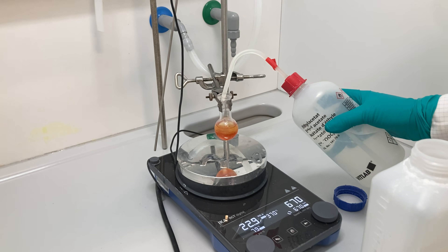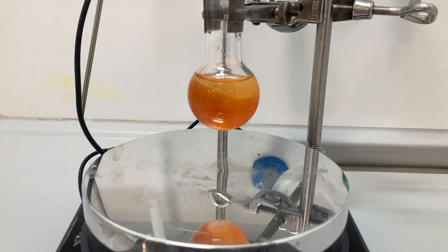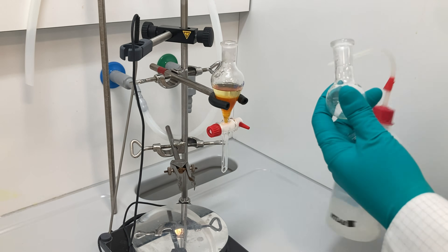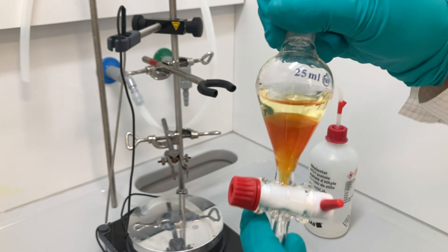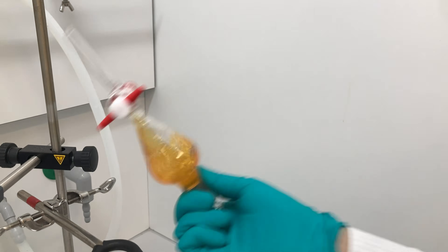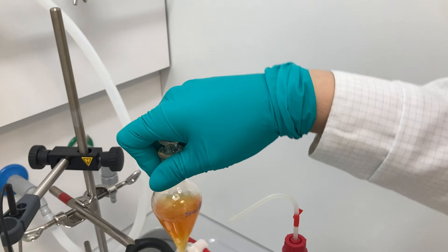I diluted the mixture with ethyl acetate and allowed the biphasic mixture to stir for a few minutes. I transferred the contents into a separatory funnel and rinsed the round-bottom flask with additional ethyl acetate. After securing the funnel with a glass stopper, I shook it gently, allowed the layers to separate, and collected the organic layer on top. I returned the aqueous layer to the funnel and washed it several more times with ethyl acetate to extract the remaining organic material.